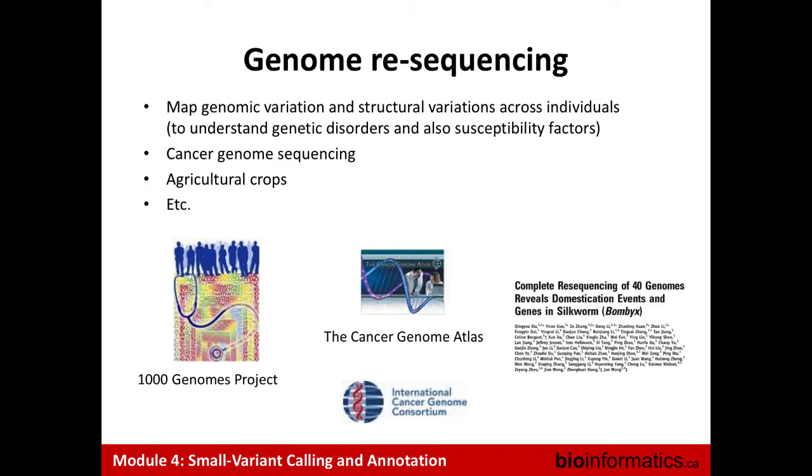Let's talk about small variant calling. Why are people doing small variant calling? It comes from all the genome sequencing efforts, where people generate these large, massive projects where they try to sequence a lot of people. What they want to do in that case is to understand what the individual variations of each person are, but also what the shared variations between people are. So that is why the interest in variation has become a really major task in the field.